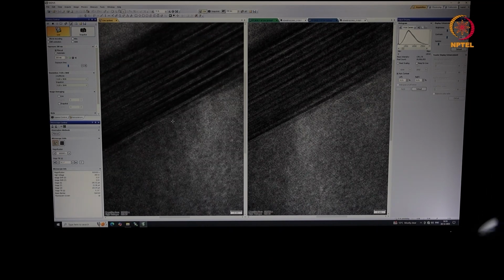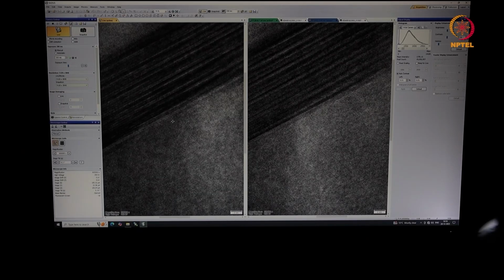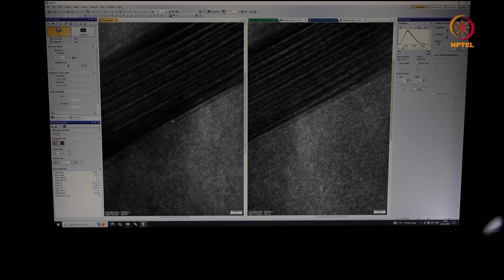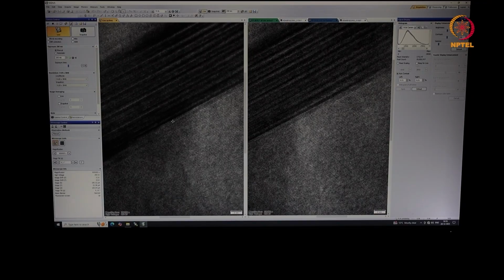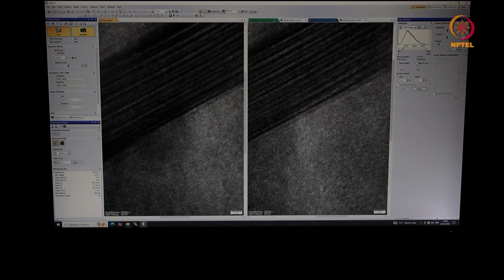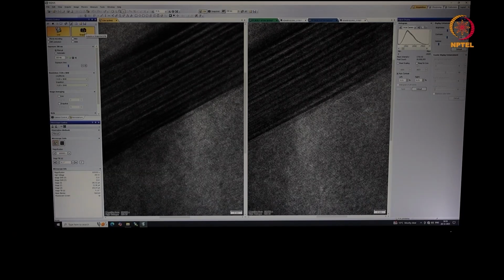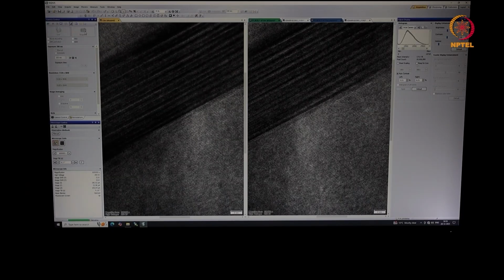And in fact, what you see here is just the fringe image, and to get the actual positions of the atoms, you need to obtain a through focus series, and this is how you do high resolution imaging on the F200 microscope.